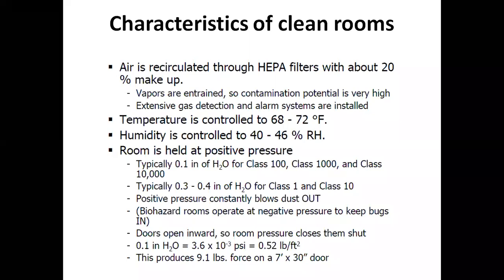The reason is we don't want those dangerous bugs, viruses, bacteria to go out of the room when you open the door. In that case, the air from the outside will enter the room, but the room air will not leave the room. That's why biohazard rooms are operated under negative pressure.